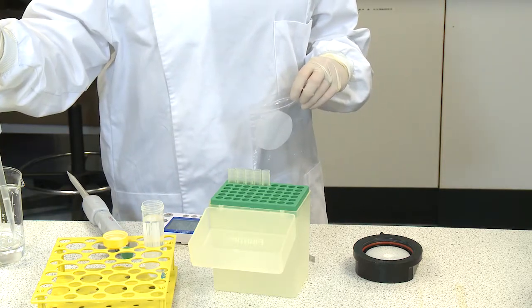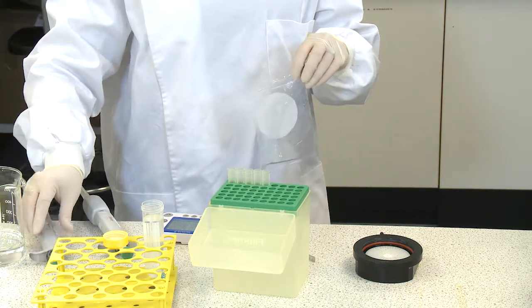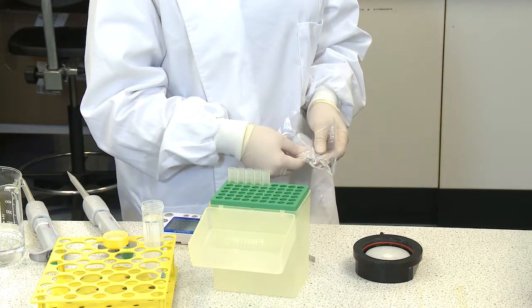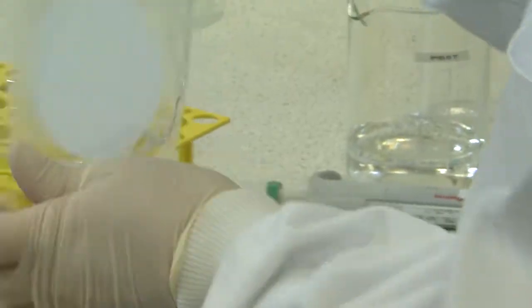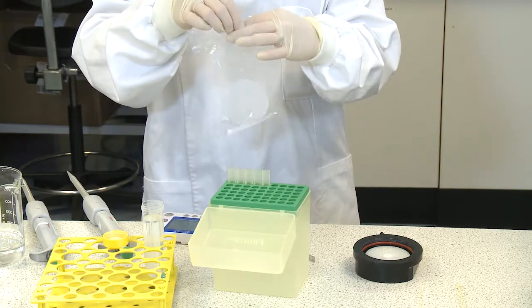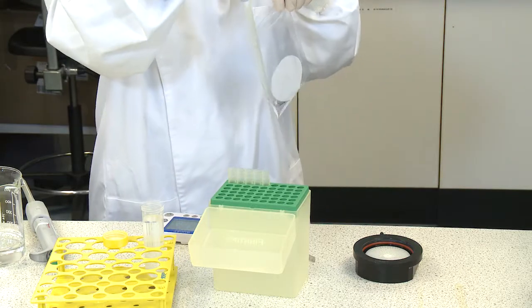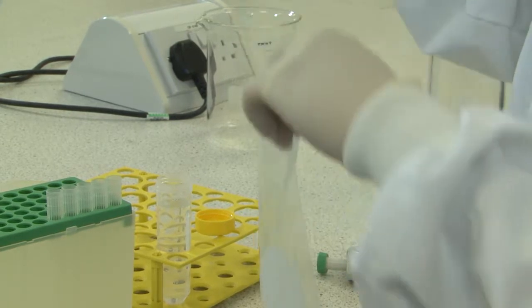Repeat with a further 5 milliliters of PBST, rubbing the membrane for a further minute. Transfer as much of the wash volume as possible from the membrane bag and add it to the concentrated eluate.